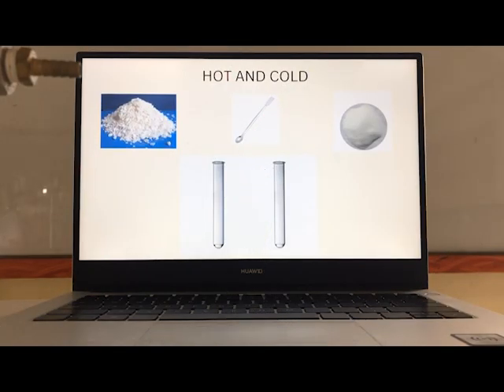Hello everyone, my name is Darling Aloha Enuso. I am explaining experiment 3. The reagents that will act in this experiment are ammonium chloride and calcium chloride, and don't forget that the pure substance is distilled water. So the two reagents that we will be using are ammonium chloride and calcium chloride.